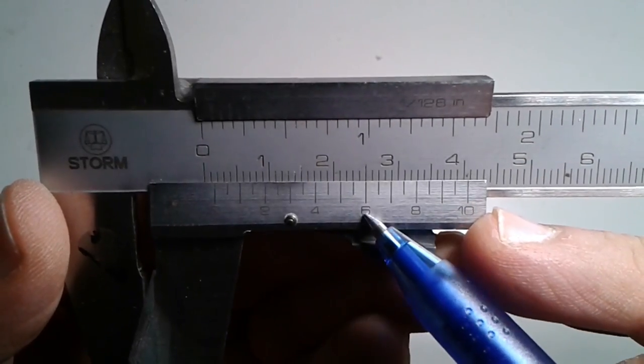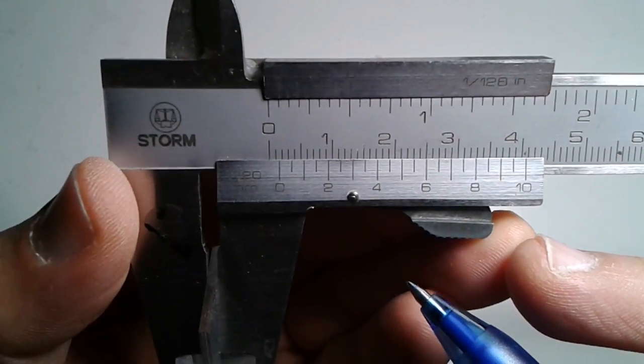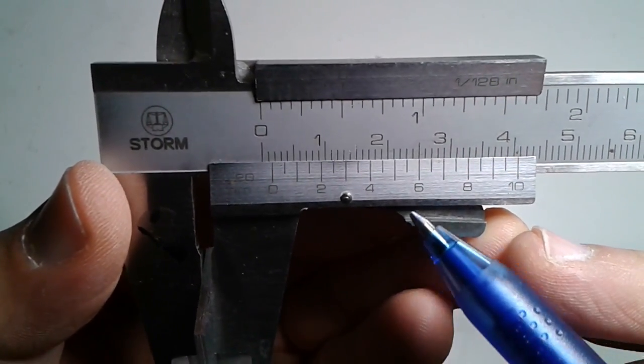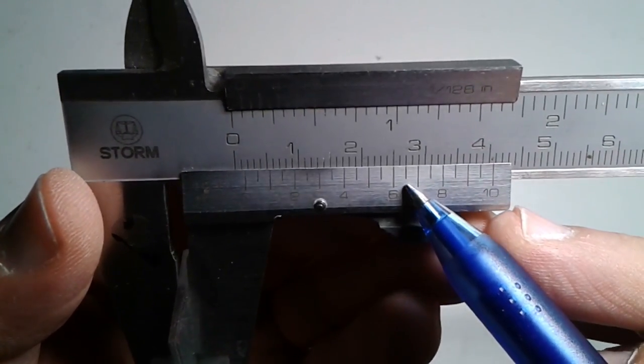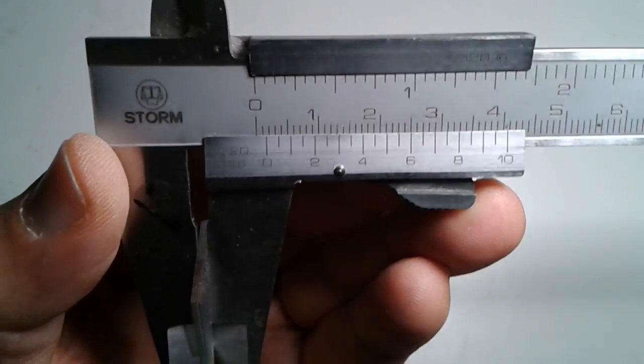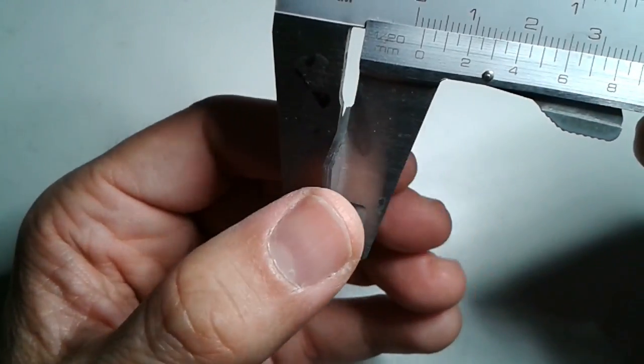Actually some people actually do this because for very high resolution microscopy you actually need to have a very precise measurement of the cover glass thickness. So there are those calipers around that people actually use to measure out the thickness of a cover glass. For amateur purposes I think it's not necessary, but yeah it's a little bit just showing you a proof of concept here.